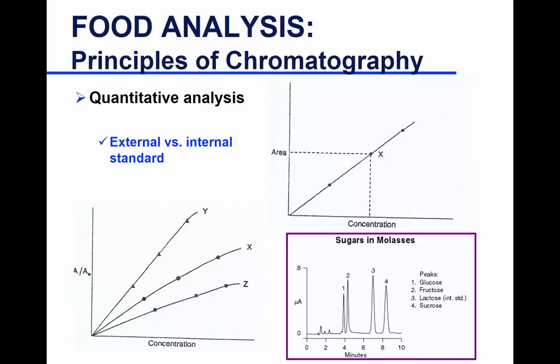What do you mean? Yeah, you make your own standard. And that's why you get the ratio. When you get the ratio, you're accounting for that difference. But one is not heavily prepared. Yes. Another is heavily prepared. Yeah, but you only get the ratio within one sample. The one that was not heavily prepared, the standard, you get the ratio of that. So you're not taking a ratio of not heavily prepared to heavily prepared. So it is the ratio of the external standard to the ratio of the internal standard in a sample that was simply prepared. And then the ratio of your unknown to the ratio of the internal standard in a sample that's been prepared. So it's within the sample, within the standard.